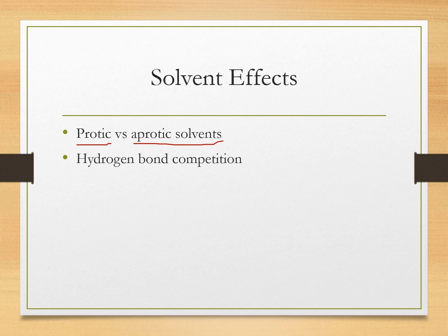Protic solvents compete with analyte molecules as they also have hydrogen protons, so they disrupt the hydrogen bonding, and aprotic solvents allow strong intermolecular bonding. For example, alcohols show a sharp OH peak in carbon tetrachloride but a broad peak in water or ethanol. This is due to the hydrogen bonding.